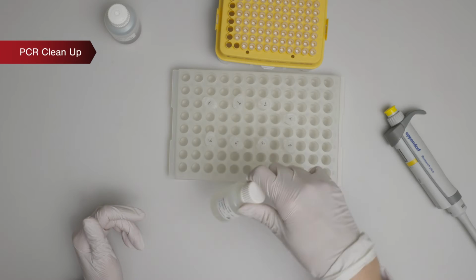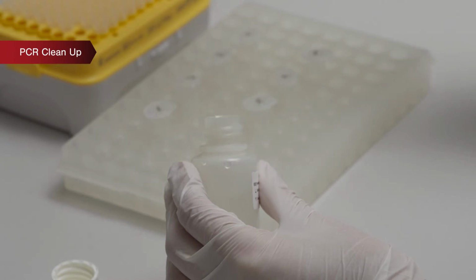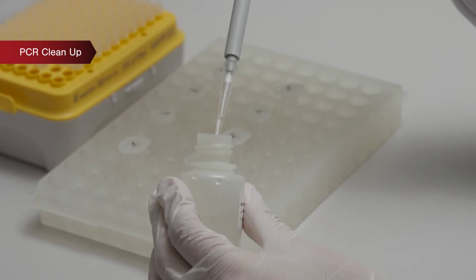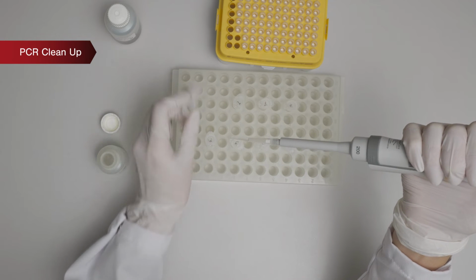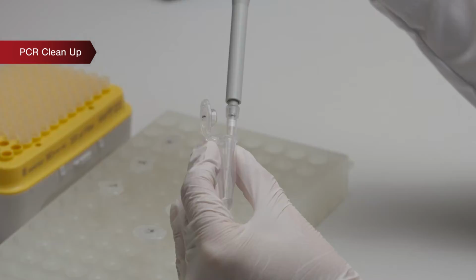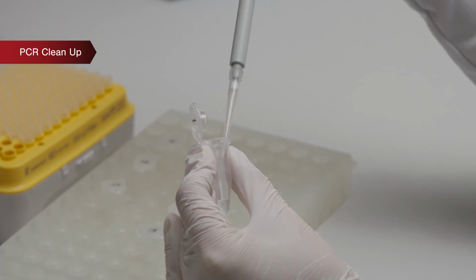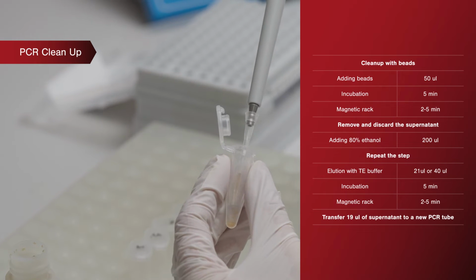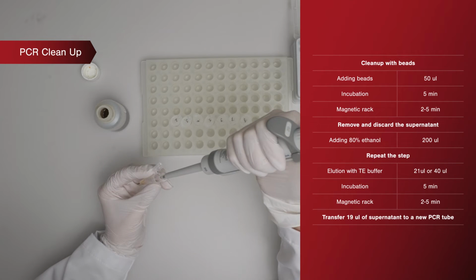After the reaction is finished, 20 microliters of TE buffer is added to each sample in order to reach the total volume of 100 microliters. After that, ligation products are cleaned up by adding 50 microliters of magnetic beads and subsequently washed twice with 80% ethanol, as previously described.